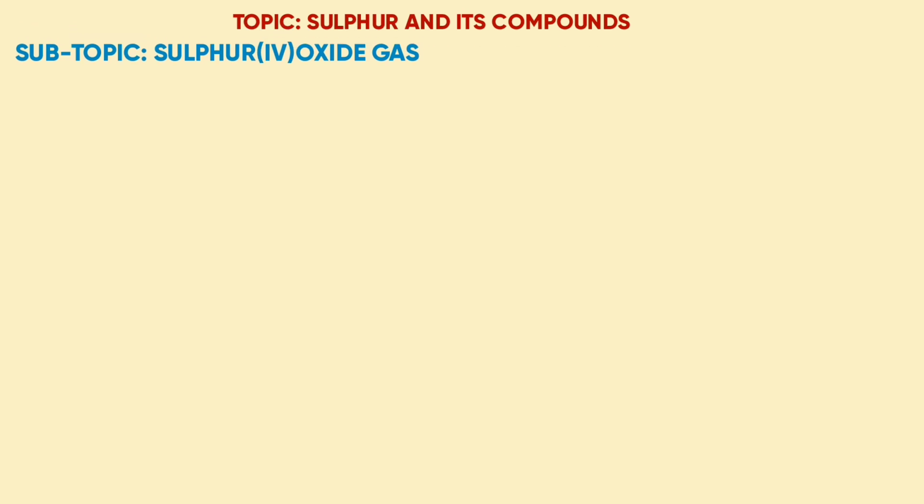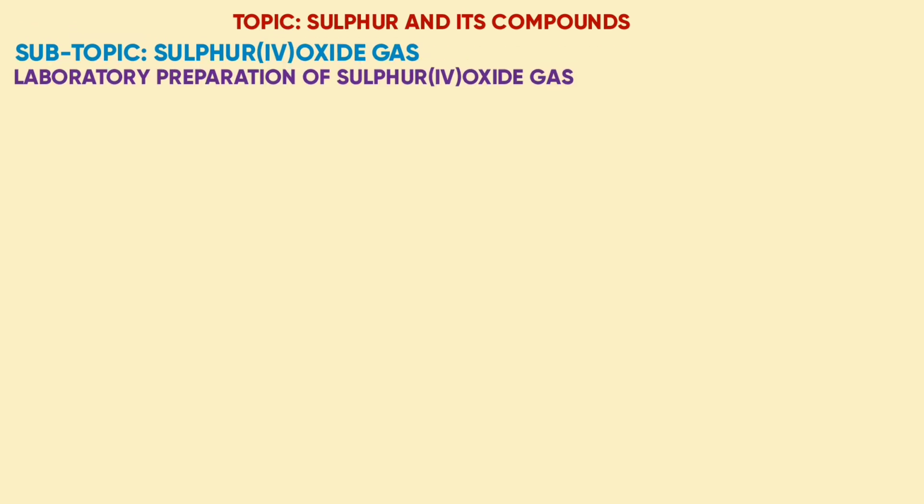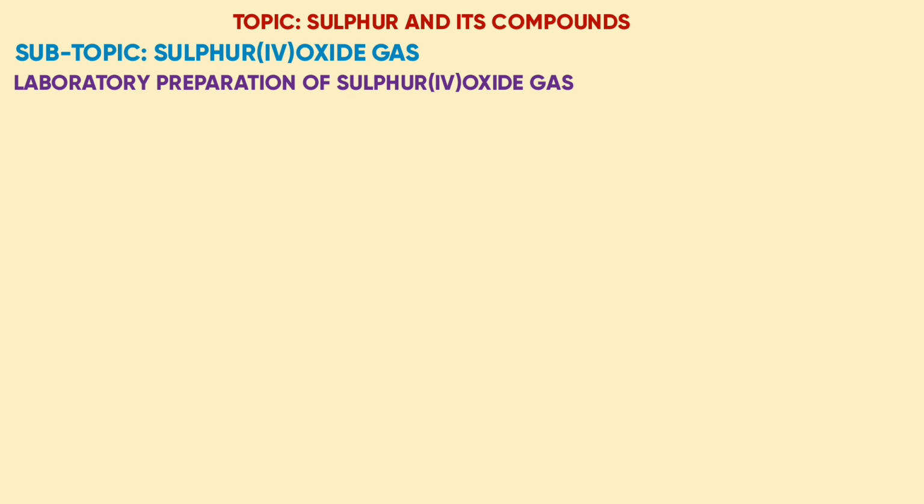Welcome learners. In our lesson today we look at sulfur and its compounds. Subtopic is sulfur 4 oxide gas. I begin with the laboratory preparation of sulfur 4 oxide.